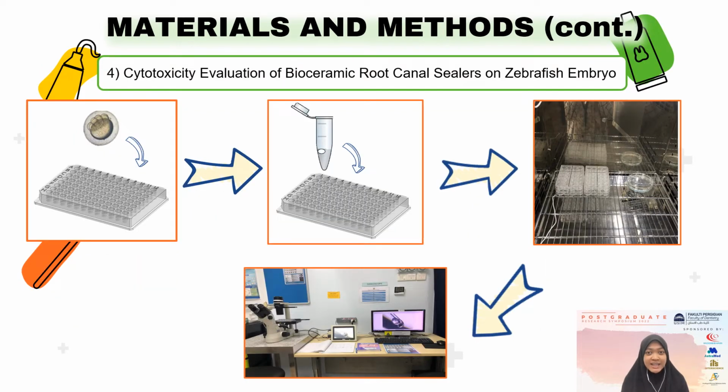The last procedure is the cytotoxicity evaluation of bioceramic root canal sealers on zebrafish embryo. Firstly, fertilized embryos were moved into a 96-well plate and divided into 6 groups, which are the positive control group, the negative control group, and another 4 groups for each of the bioceramic root canal sealers. All plates were incubated. The zebrafish embryos were examined at 24, 48, 72, and 96 hours post-fertilization using a digital camera linked to an inverted microscope.